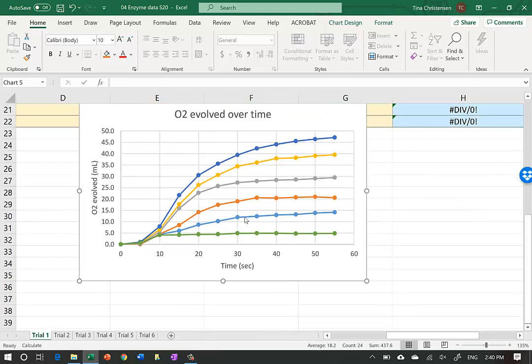Here we have Trial 1 in light blue, Trial 2 in orange, Trial 3 in gray, Trial 4 in yellow, Trial 5 in dark blue, and the control in green. Remember we used a syringe and injected about 5 milliliters of a hydrogen peroxide and water mixture. The control shows no reaction - notice this is 5 milliliters and the control never got any more oxygen evolving. This initial displacement is because you injected 5 mL of fluid into the reaction chamber, displacing 5 mL of air.